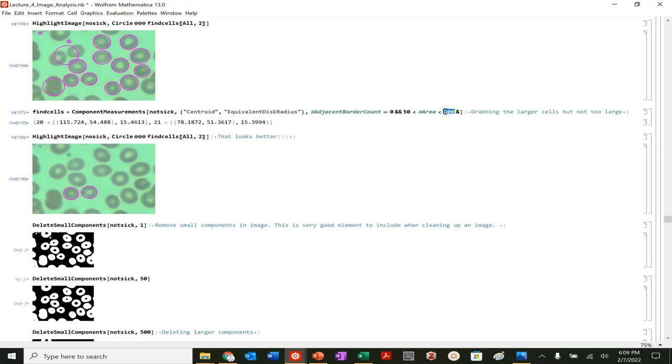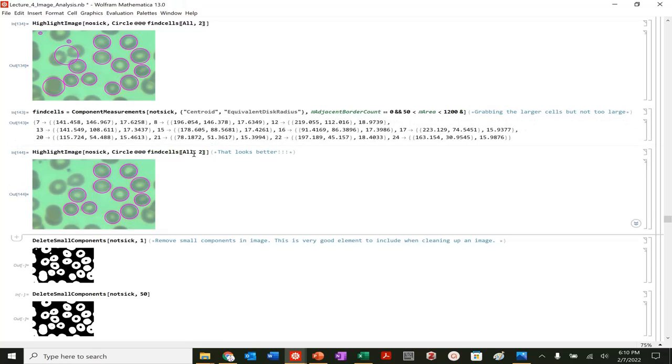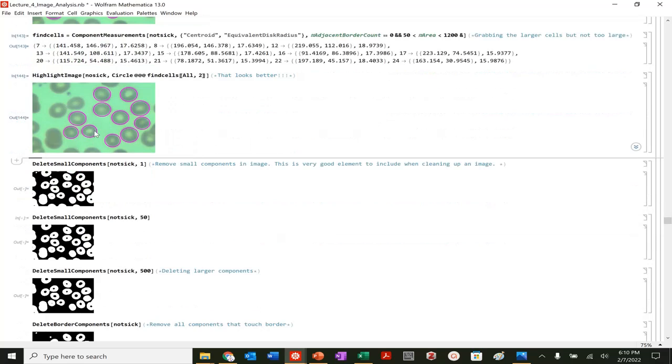Oops, maybe 900? Let's do, maybe I need to do this. Let's do, how about this? Yeah, so you see, you can fine tune this pretty well. So we're pretty close to getting those values here.